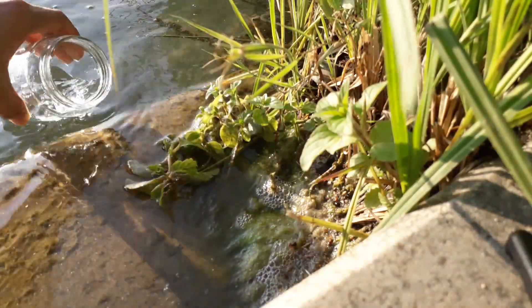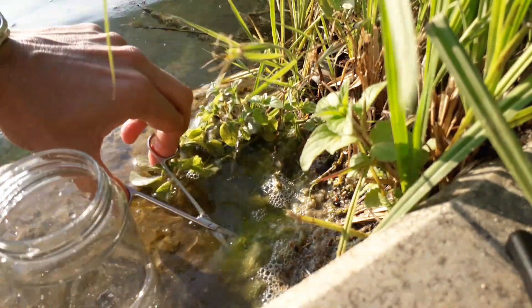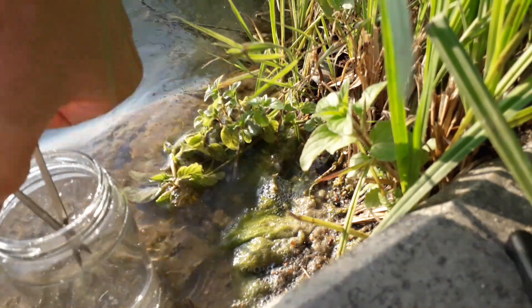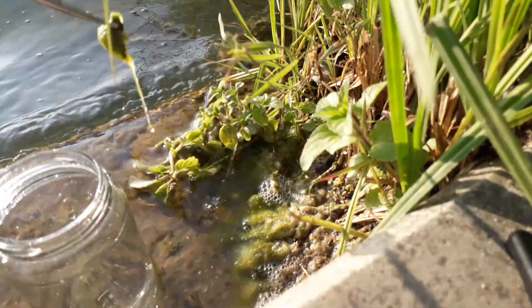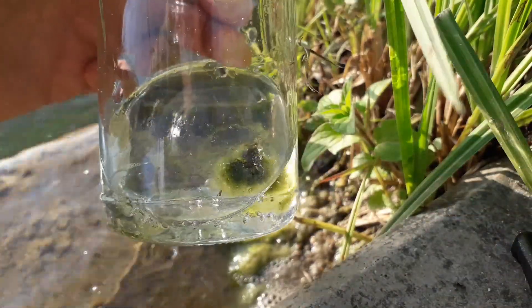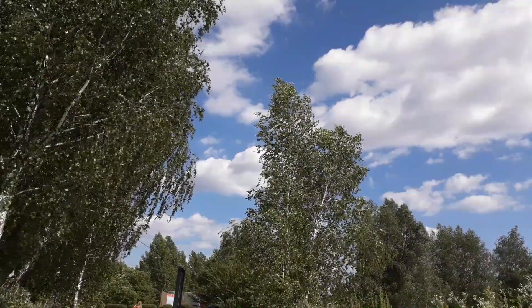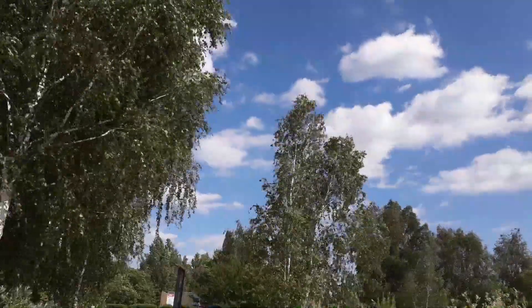The most difficult part was actually to find a place for the camera, but here where there are some concrete steps, this was a very ideal place. As you can see, I'm not collecting only a water sample but also some solid material — in this case some algae and some other gooey stuff I found there, because this is where all the microorganisms are growing. Microorganisms frequently form a so-called biofilm, and in this biofilm there are usually a lot of algae, bacteria, and of course all the other sessile microorganisms.